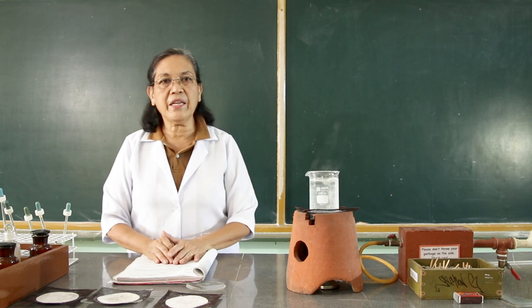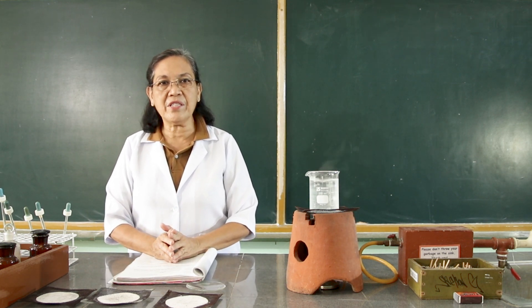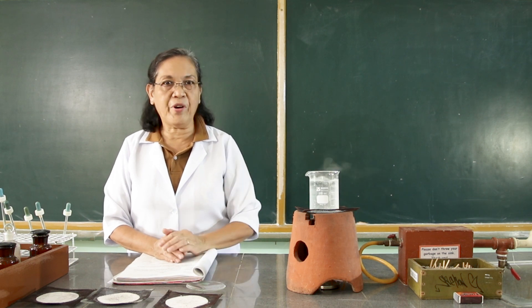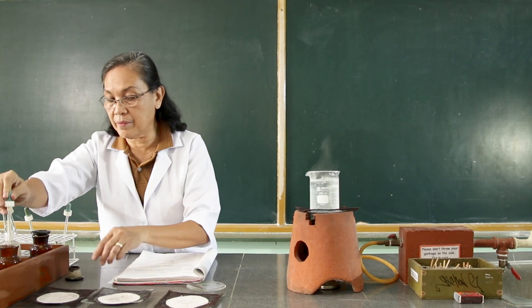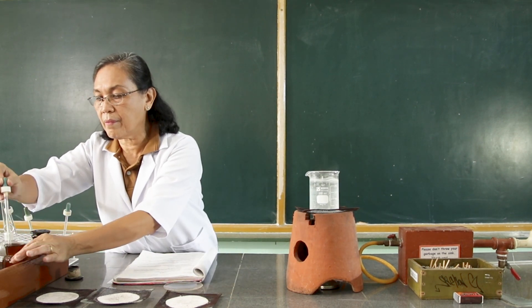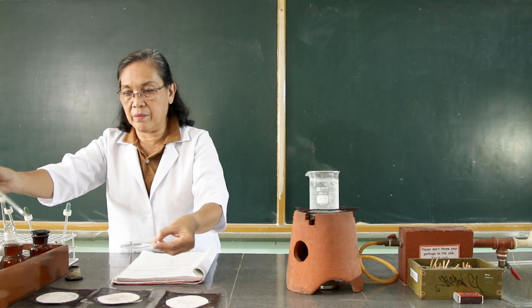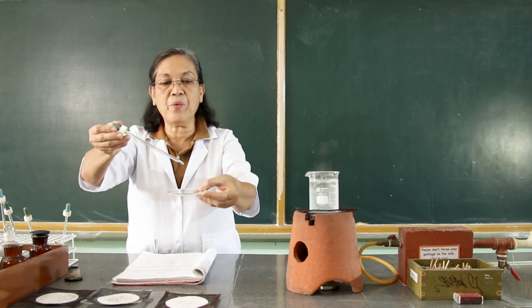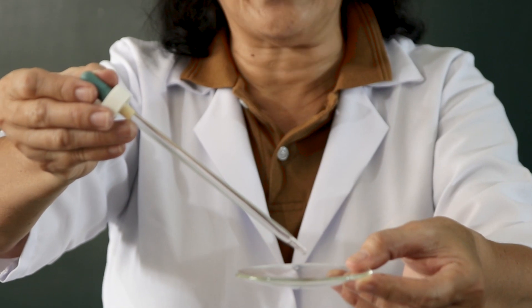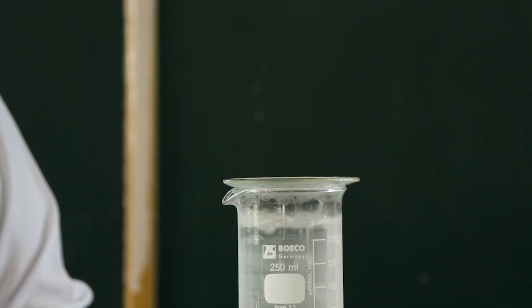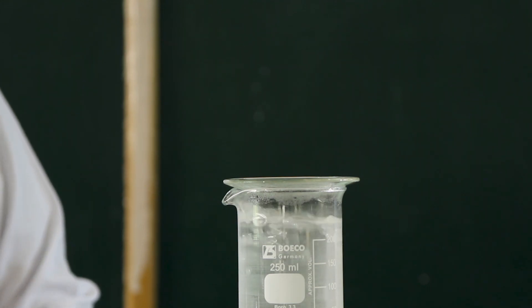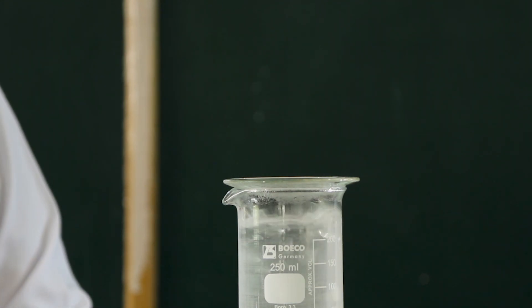We will evaporate a drop of the ammonium hydroxide. We will place one drop of ammonium hydroxide into this watch glass and evaporate it over the water bath. We will let it evaporate for 15 minutes.